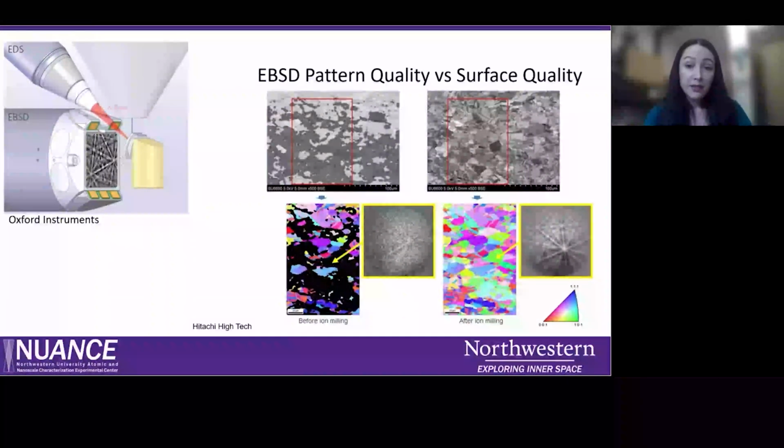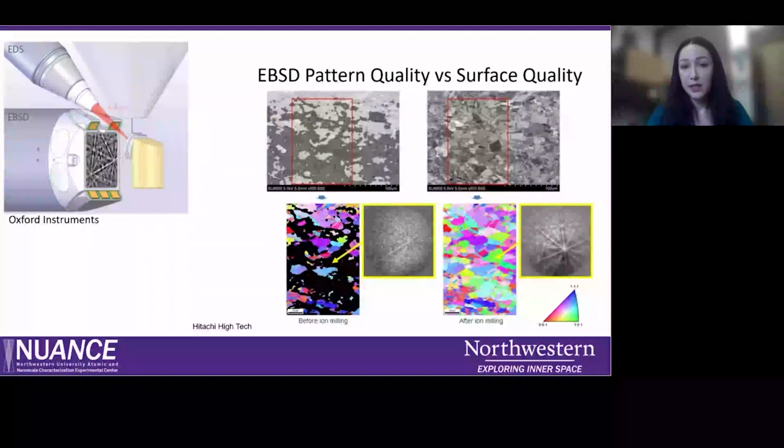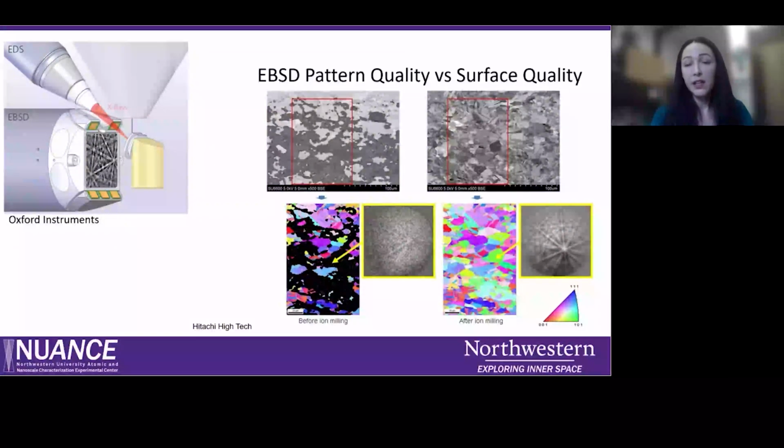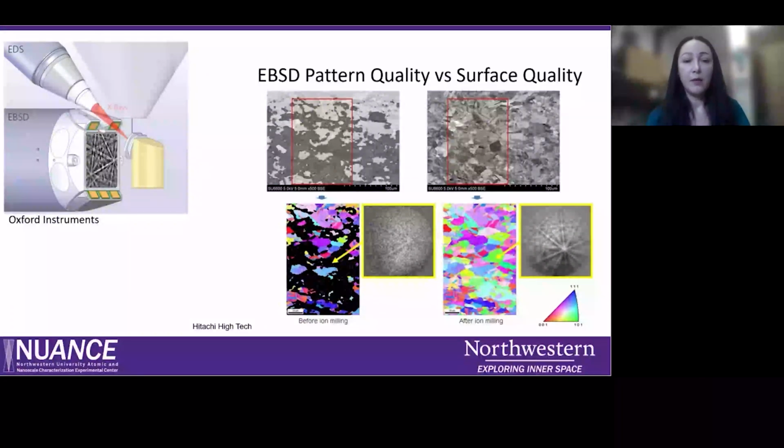We have a lot of EBSD users here at Nuance, and so a lot of you are probably well aware of how important polishing is for getting good EBSD data, and you're probably very aware that this is not a trivial matter. It's a big bottleneck, I think, for a lot of you when you're trying to get EBSD data, where it could be very tricky to figure out the best way to get that good surface.